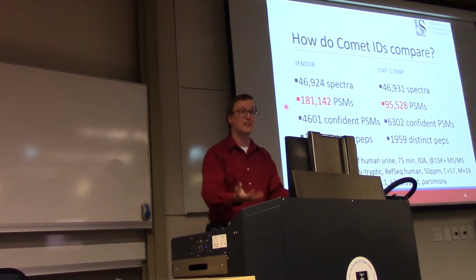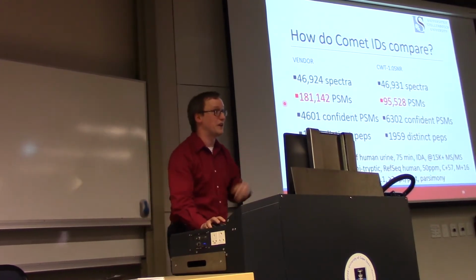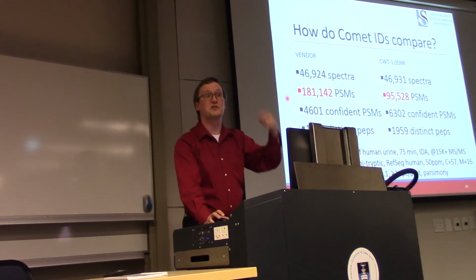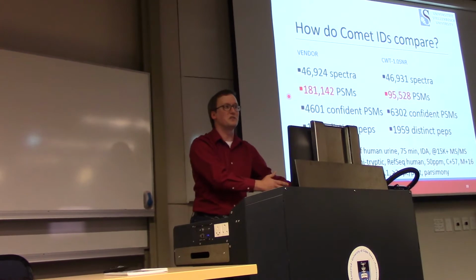And when I came in the morning, they were done. But it's a lot slower than what you're accustomed to doing when you're doing mzML. So that's a big point in don't assume. Don't assume that translating these data to something you can use with your open source search engines is going to be easy or fast.